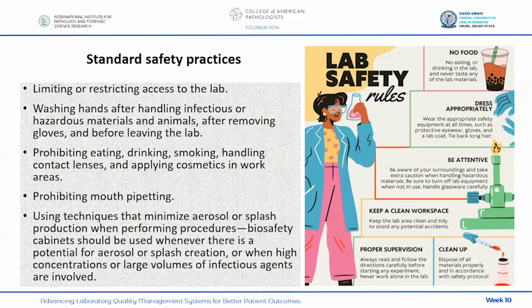Okay, so what are the standard safety practices in the laboratory, which everybody should be aware of? The lab is not a thoroughfare. It is not an all-commerce business. So only authorized personnel are allowed to have access to the lab. Hand washing, hand hygiene is very important, especially for lab personnel. After you handle infectious or hazardous materials, for those who work with animals, when you handle animals, after removing your gloves, because there is this myth that once you wear your gloves, then you may not need to wash hands again. That is incorrect.